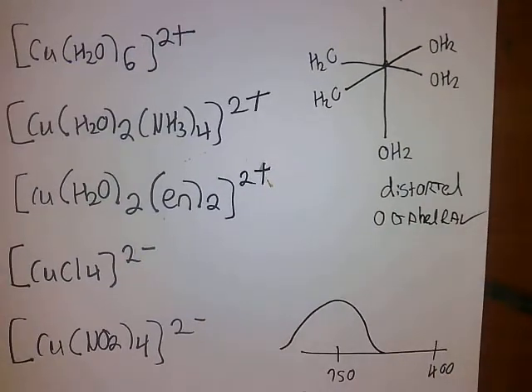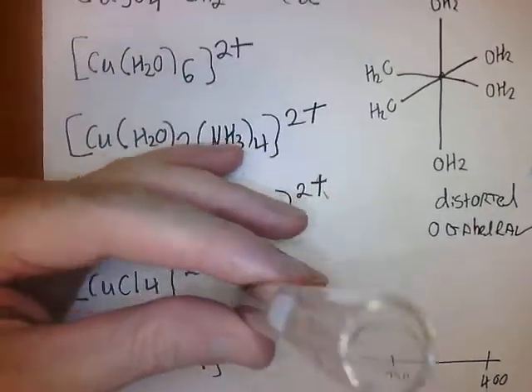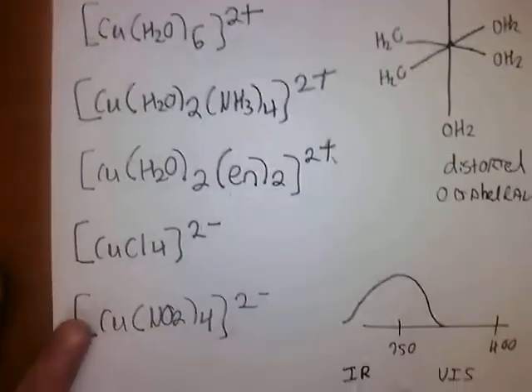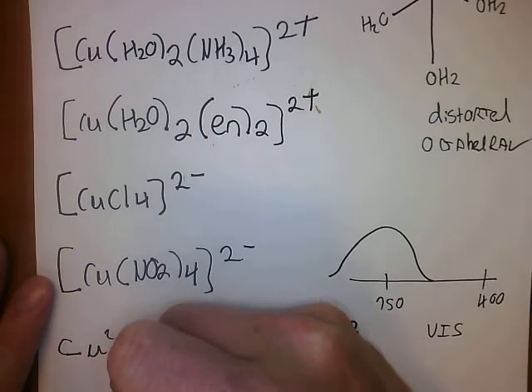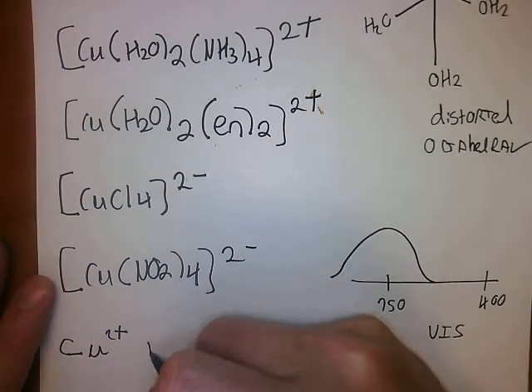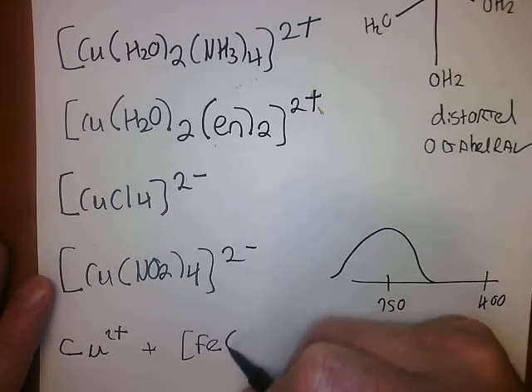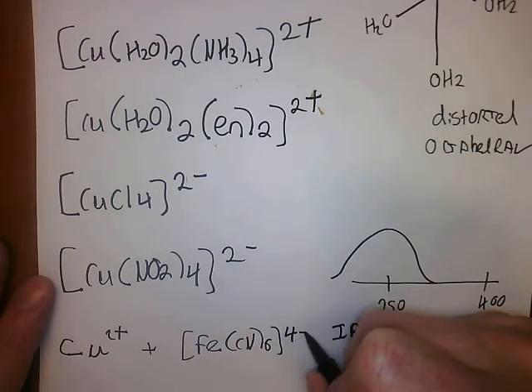So let's go back to our copper page here. Right, so what's going on here? We're mixing copper ion with ferrocyanide. Right?